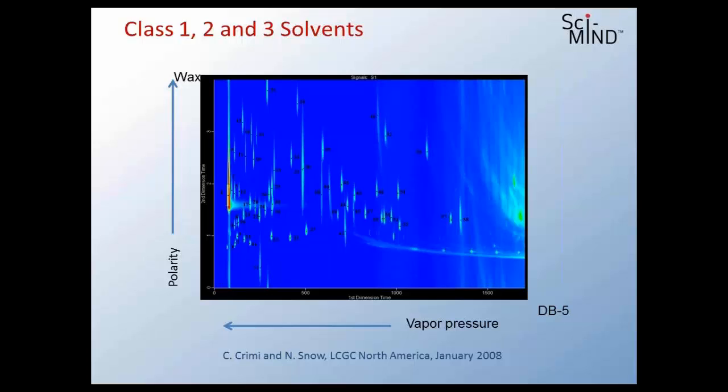We're probably toward high resolution. We're a little bit further away from easy to use. So high resolution and moderately fast, we're not quite as easy to use because the instrumentation is a little bit more complex. But we are able to separate everything with high resolution. That's a little bit of an example of separating solvents and some different approaches to it that sort of land on different parts of that triangle.